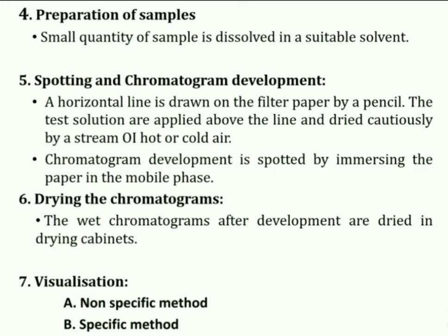Next is preparation of samples. Sample preparation includes the dissolution of the sample in a suitable solvent. Solvent used in chromatographic technique should be inert with the sample under analysis.